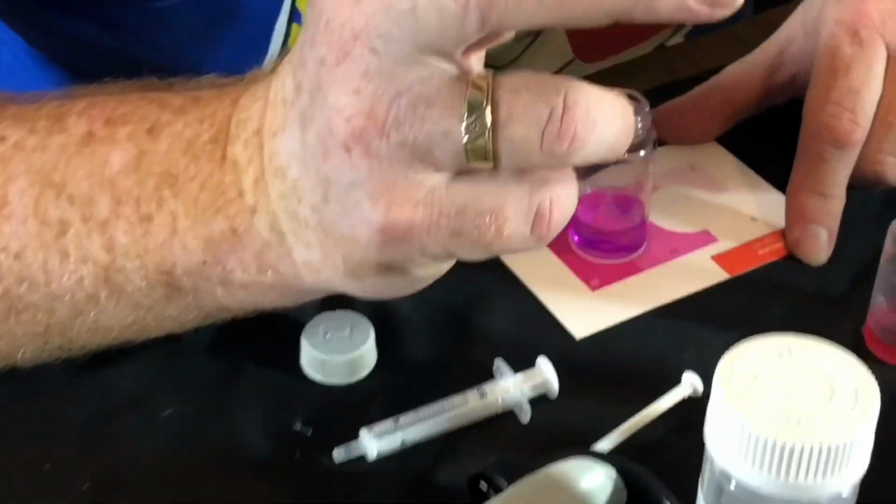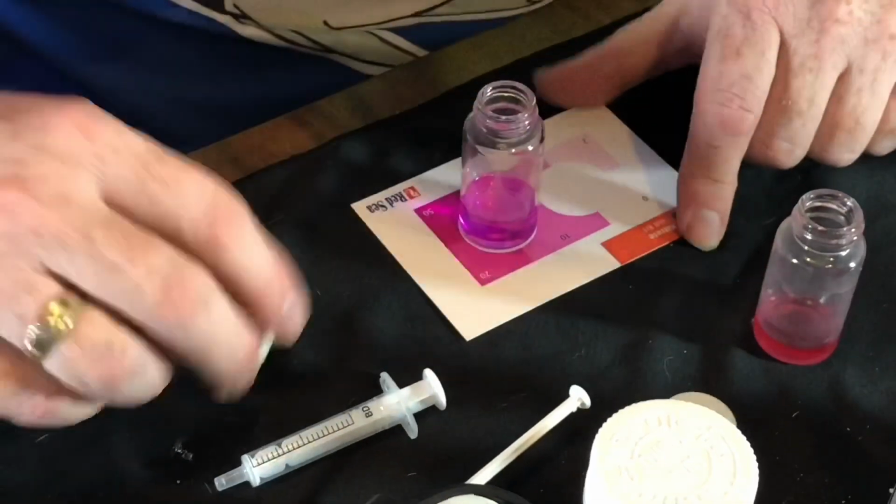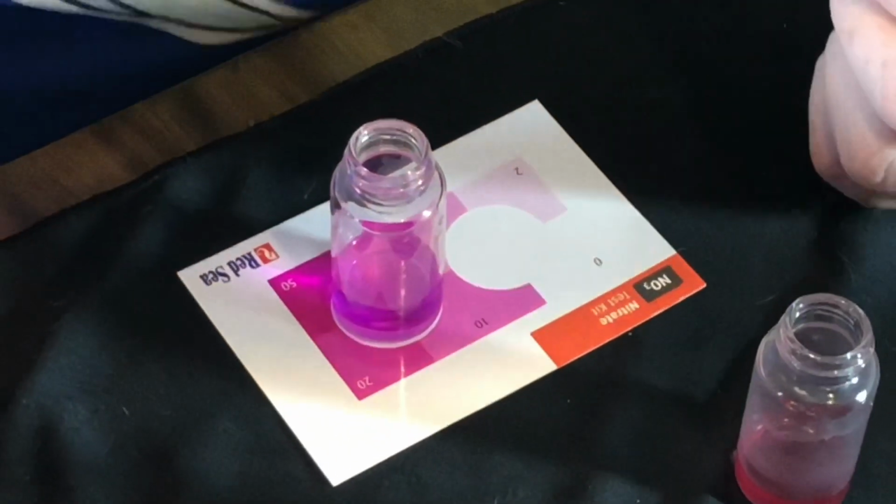We know we've got a bit of a nitrate issue. We've always had a nitrate issue. We do dose Nopox, but it did run out the other week. And we've also added a lot of new fish to the tank just recently. So, Darren, record nitrate at 20, please.